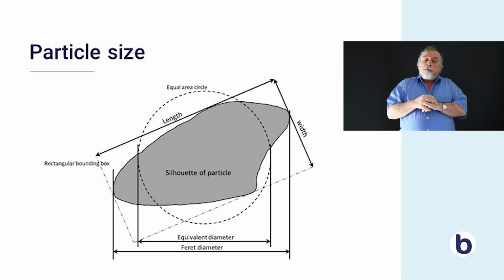There are other ways of measuring particles, like a particle counter. They look at the equivalent diameter of a particle, and that I often write with a small d. So, the particle deposition rate determines the contamination risk: the risk of surface contamination of your product, your process, your patient.